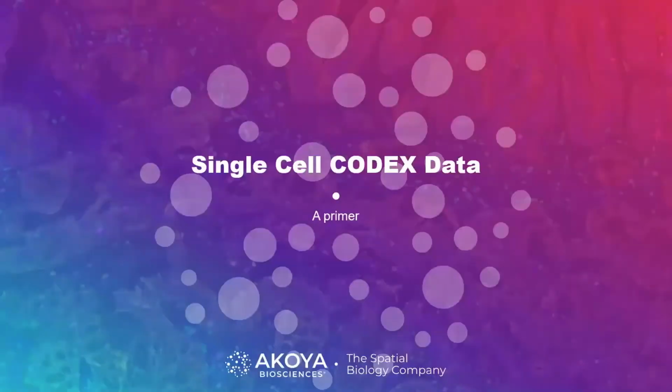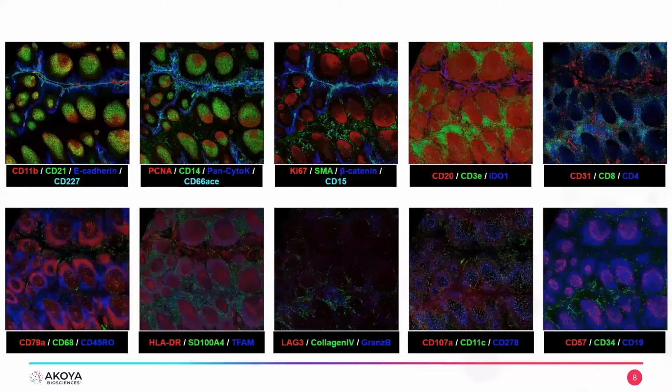So one of the other things then to touch on is, what do Codex data look like? What does single cell Codex data look like? I'm just going to give you a primer on this. What you can see here is another different Codex experiment that we've done. In this case, we labeled a human tonsil with 39 different biomarkers, antibodies. Each one of these images shows you a representation of this very same tonsil. Each time, it's labeled with different antibody combinations.